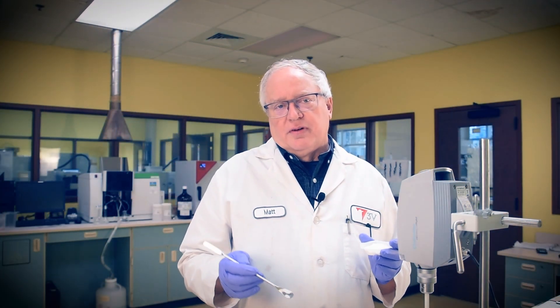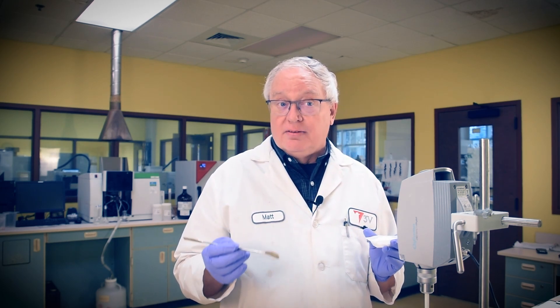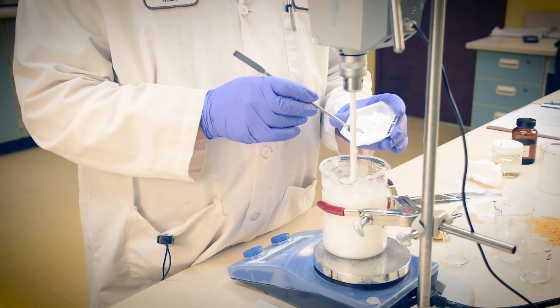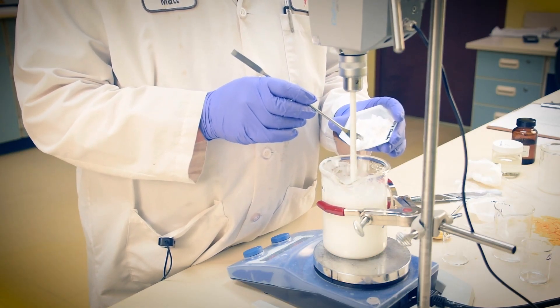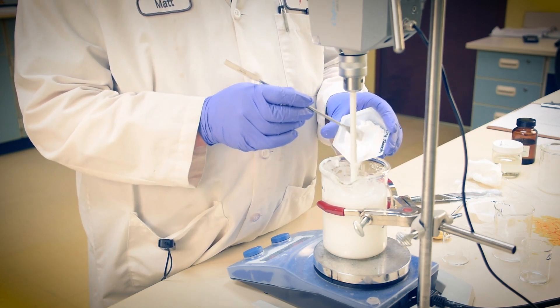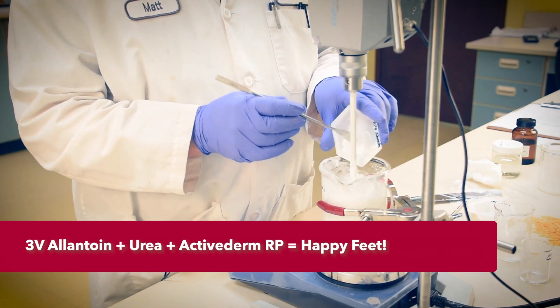We've added our preservative — always important — and some peppermint oil for a nice cooling aroma. Time to add the final element: Actiderm RP rice starch. This product is an outstanding natural offset to talcum powder with an even silkier sensorial sensation. RP creates soft feet with clean beauty while doing double duty by stabilizing urea.